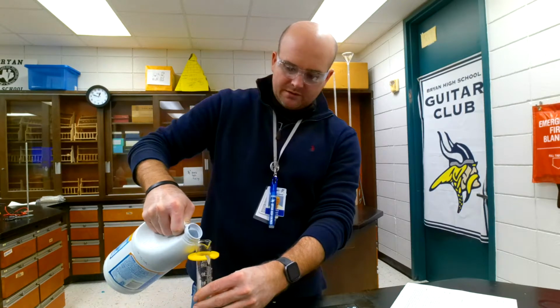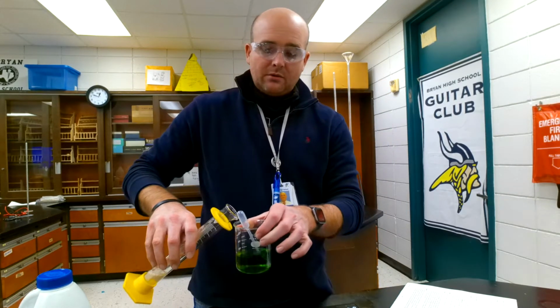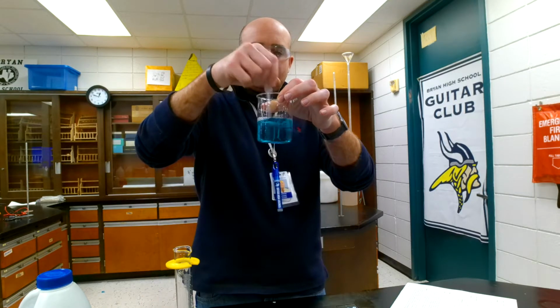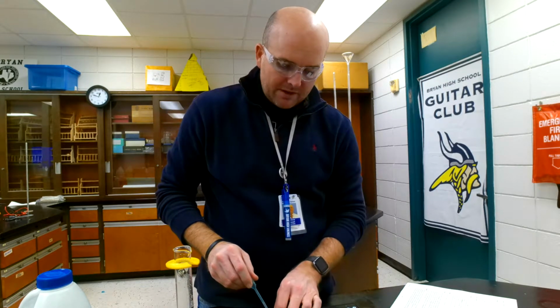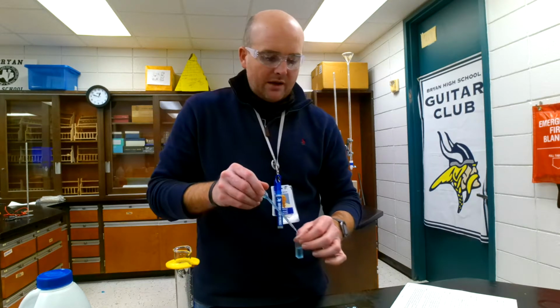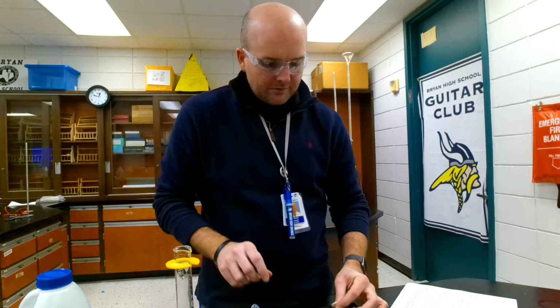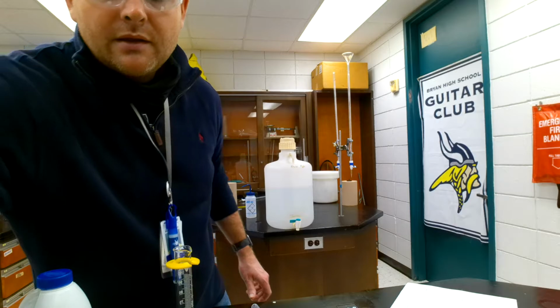I will pour 20 milliliters of Clorox into here. And then once we begin, I will quickly move it over. So just as you can see, it changed color to a blue color. And then now I'm going to pipette it very carefully, because I do not want that many bubbles. The turbidity of the sample does matter. You want to make it a very clear sample. Go as quick as I can. And we're done.